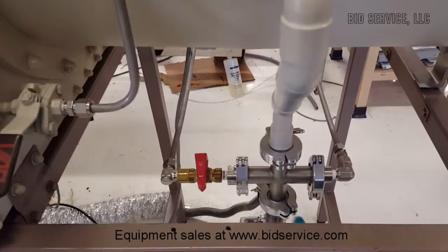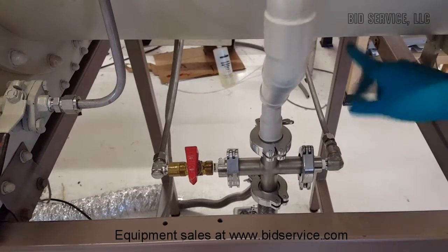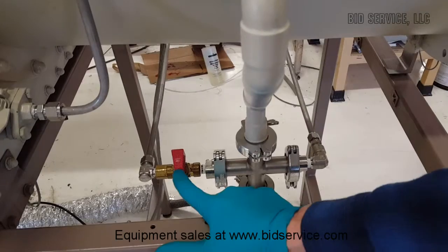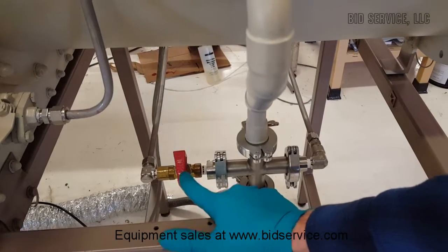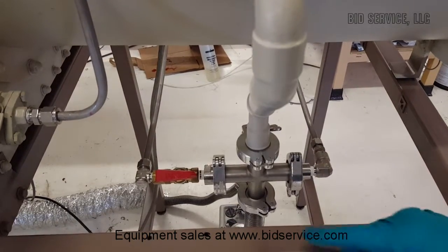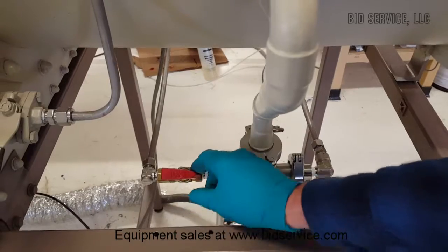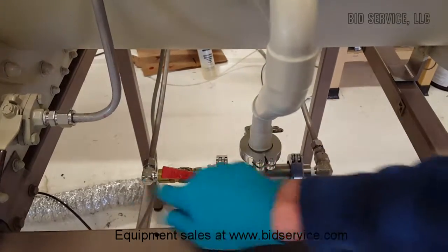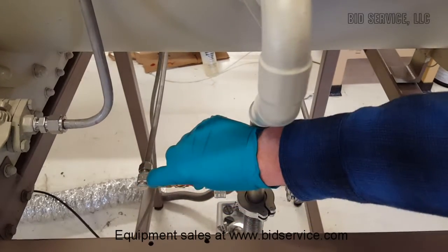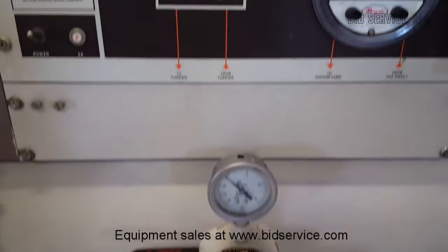So it tees off: this side goes into the controller and back into the box. This one is used for regeneration — when you're doing a regen you want to open this orange valve, that's the open position. This only needs to be opened during the regen of one of the purifiers in the back. This leads out to a vacuum manifold — I'll explain that when we go in the back later. And as you can see, we're now at a negative pressure.